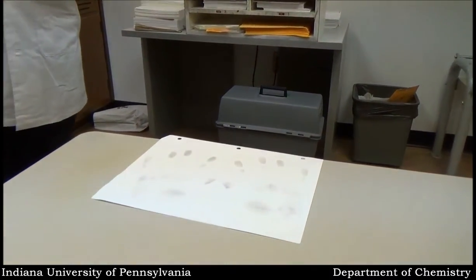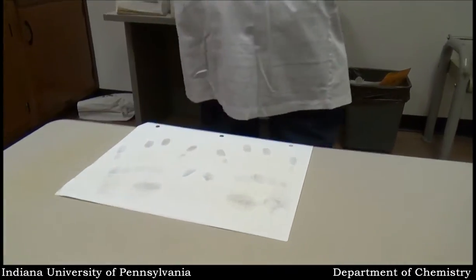Right out of air. Now those prints are visible from the iodine fumes. The longer they sit there, the more likely they are to fade.